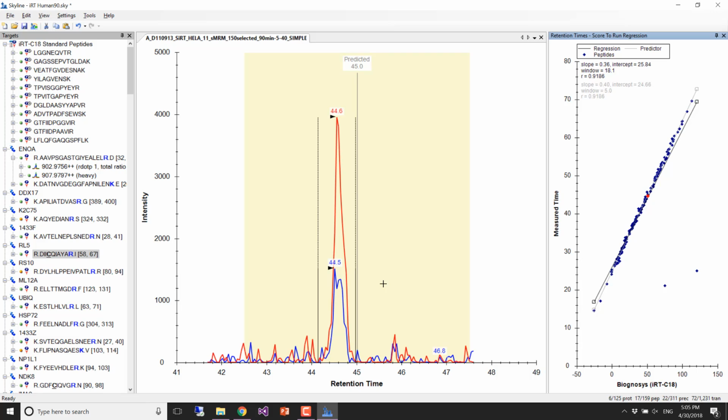And by what function of the measurement? What is it based on? You mean running replicates and then looking at the distribution around some replicate? If you run one run, then the only thing that you could choose to make the window wider on is the width of the peak.